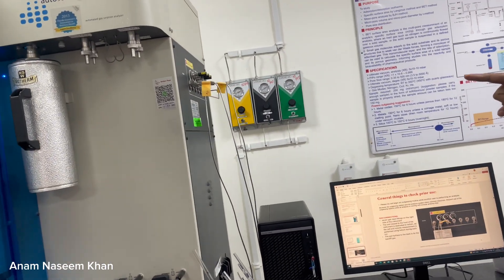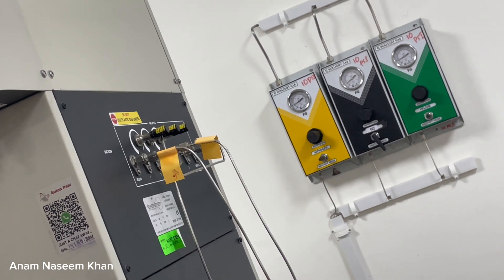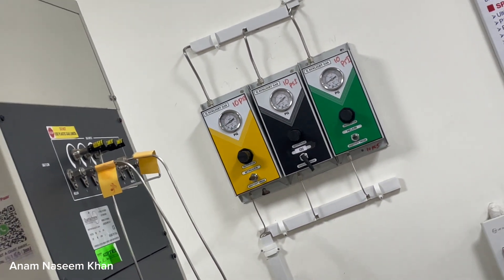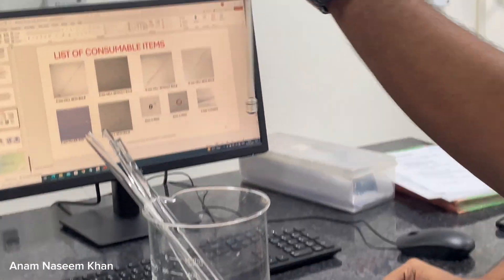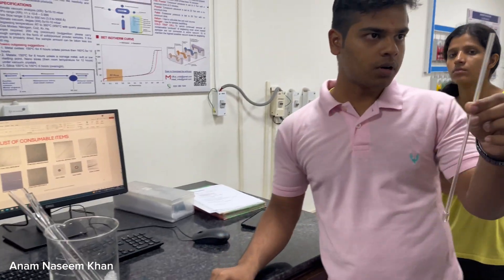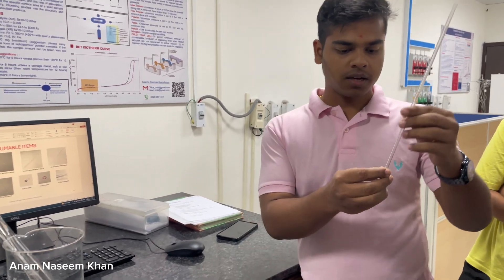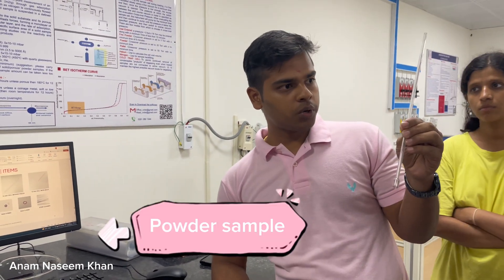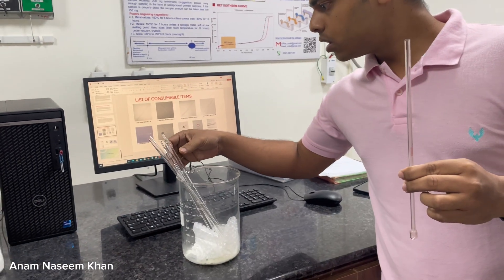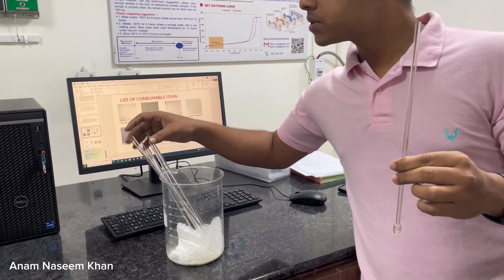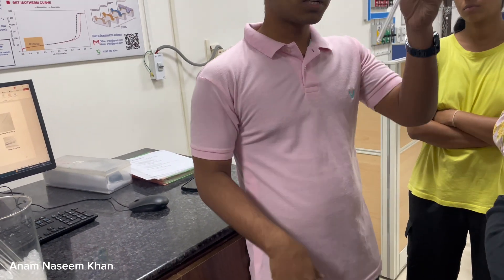Gas input and the backfill process allow you to input both nitrogen and helium gases. This is the sample holder tube. There are different types of tubes used here — this is a 6 mm tube and this is a bulb type. For powdered samples we use this bulb-type tube, and for pellets, soil, and other sample types we use the regular tube.